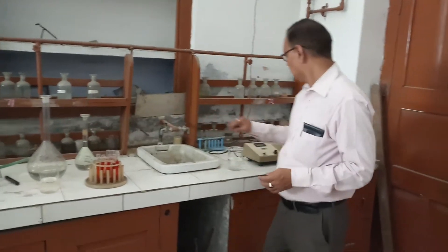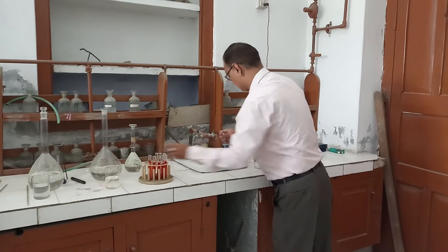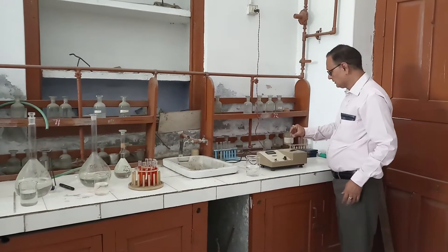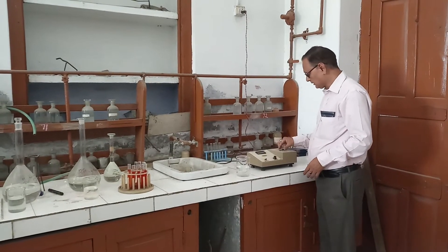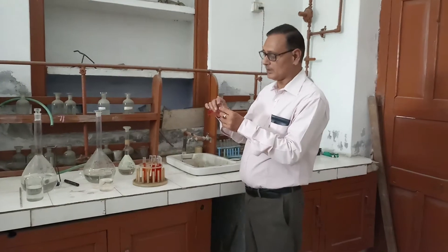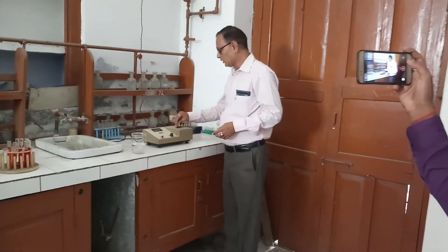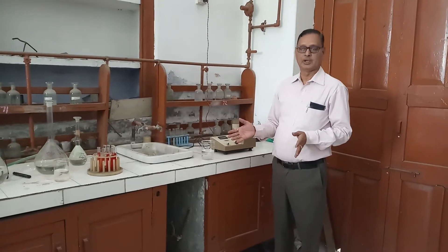Likewise, we will take the absorbance by removing the cuvette, washing with distilled water, and again standardizing with distilled water. This will be standardized by putting the cuvette into the colorimeter and calibrating to zero. Then again use the second solution containing 2 mL of iron and 8 mL of 1,10-phenanthroline complex, put it into the cell and find the absorbance value. We will find out the absorbance for all 10 solutions.